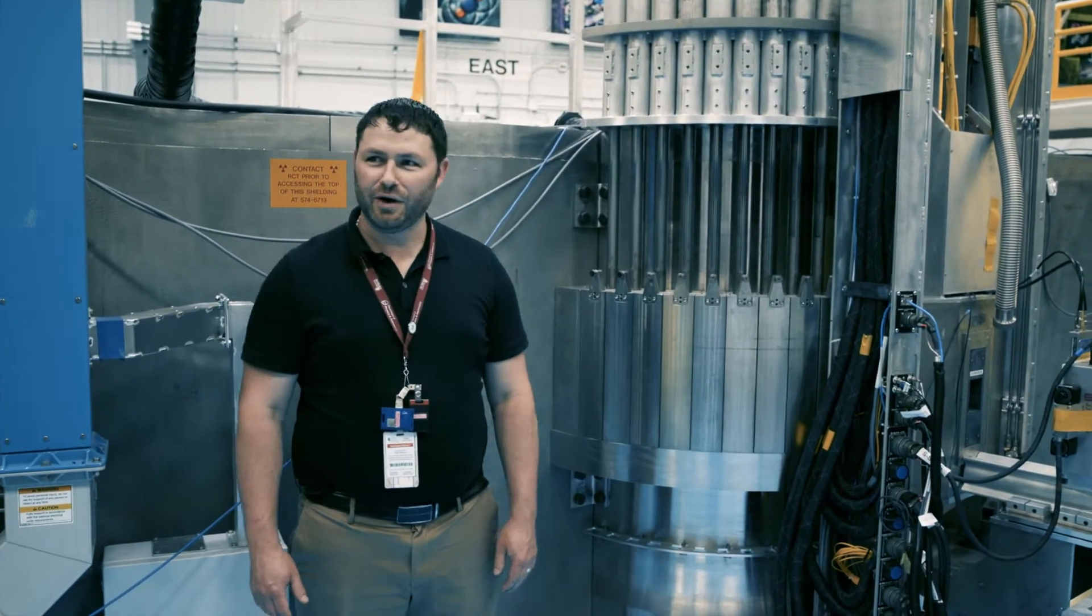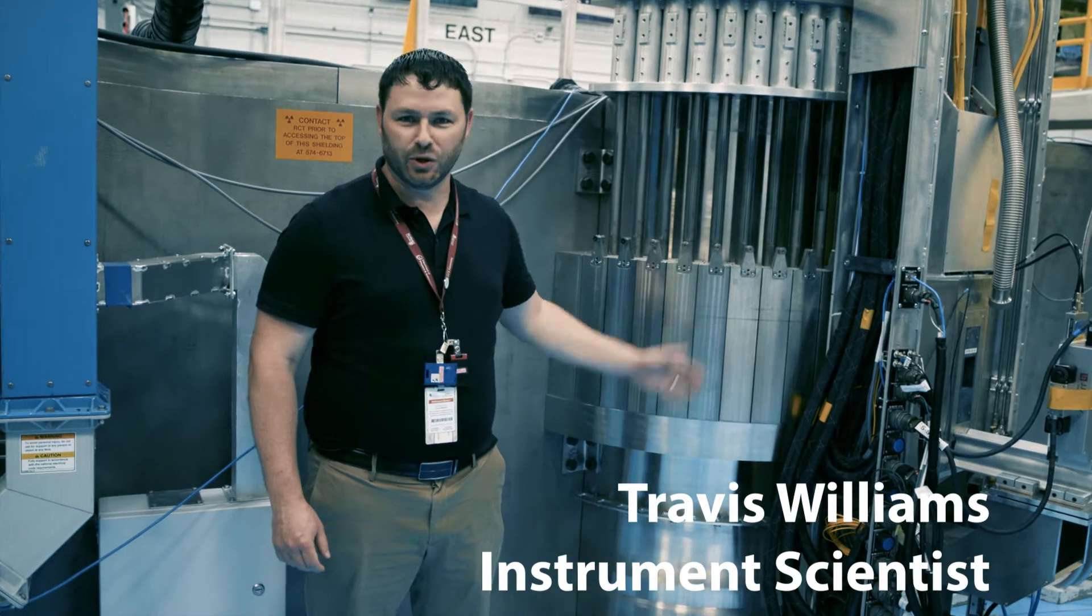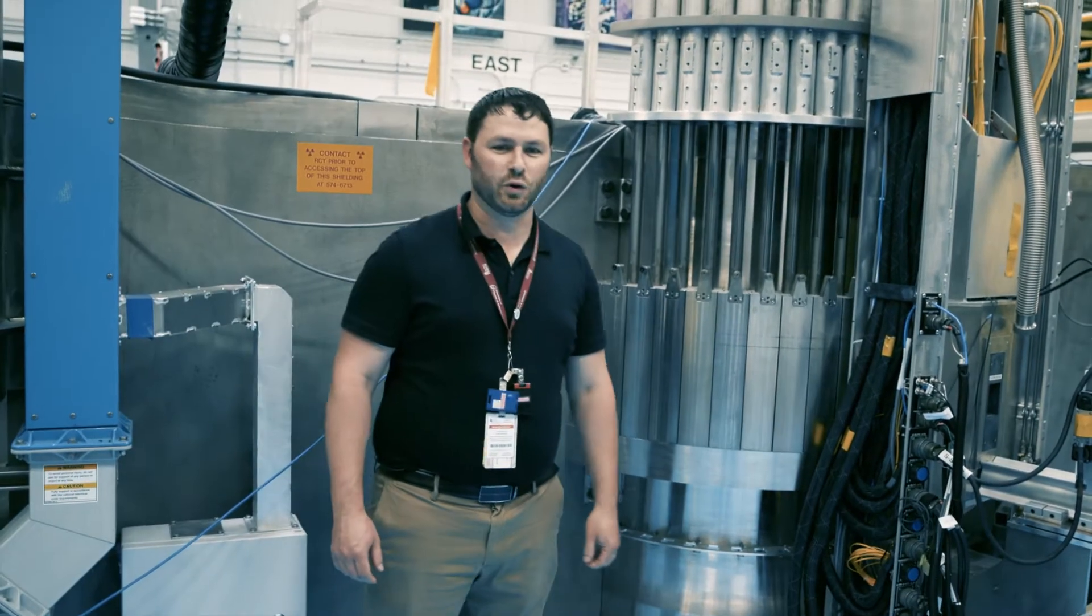Hi everyone, welcome to HEIFER and welcome to the COLD Guide Hall. So this is the COLD Neutron Triple Axis instrument, CG4C.